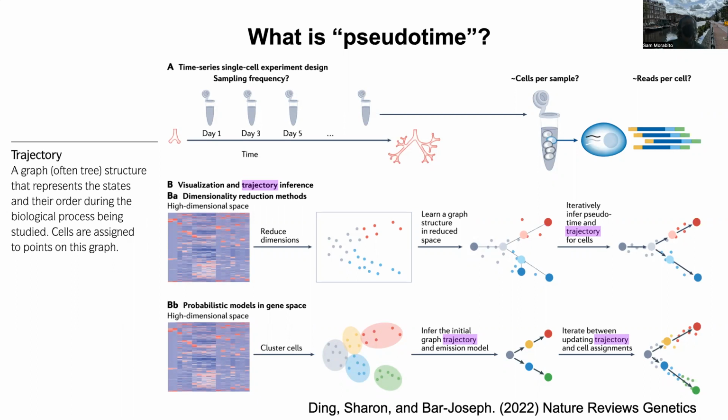So do those tools that only work with time series data do supervised pseudotime, where they have labels for each cell? Yep, I know this term, I don't really know what it means, but I've heard it a lot, which is optimal transport. It's an optimal transport algorithm that takes into account the time point, assuming that you have actual time series data.